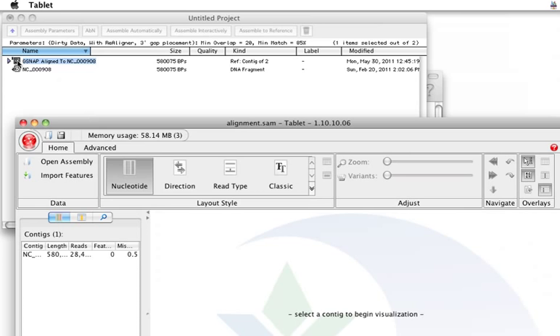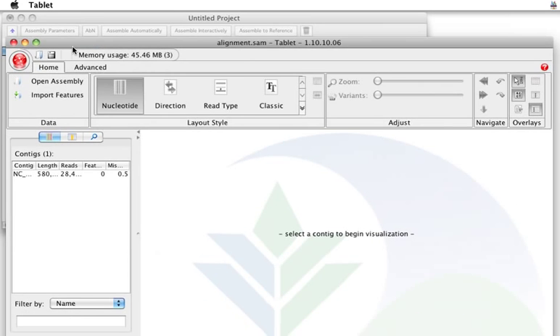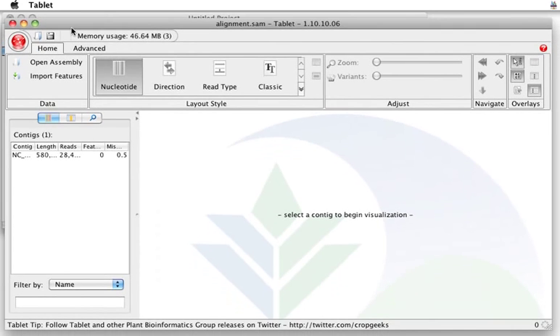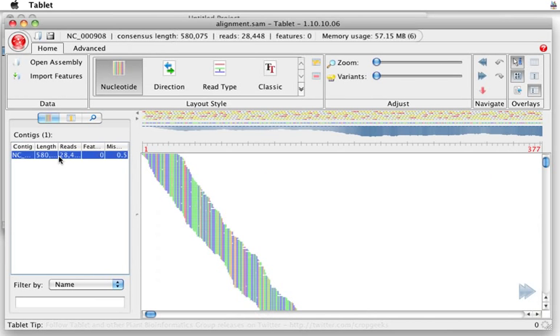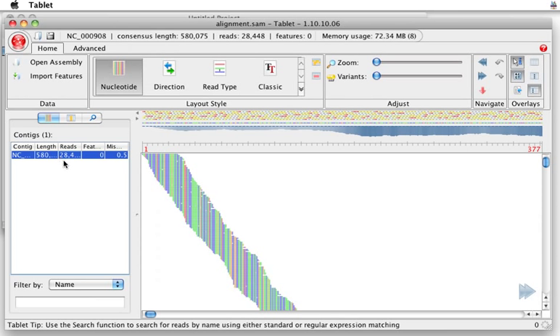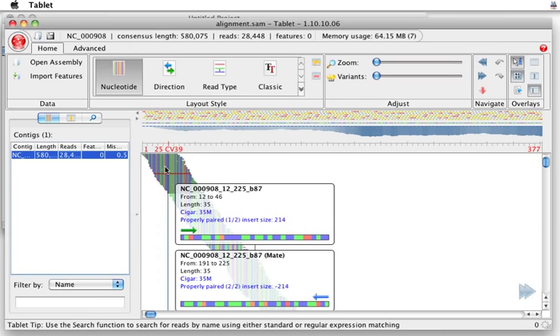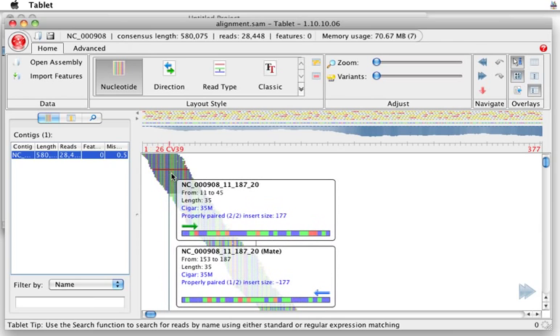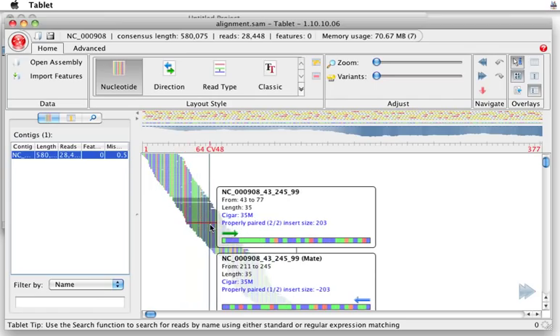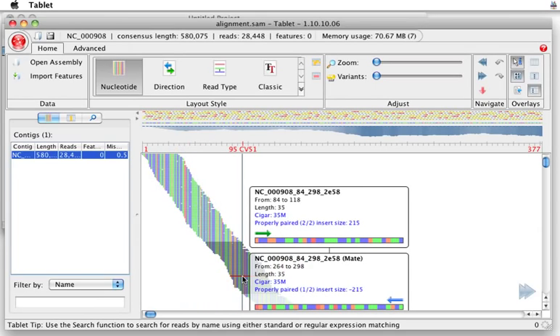You can do all the things that you're used to with Sequencher, building variants tables, doing restriction maps, all the normal analysis right in the Sequencher window. But you also have these new tools that we're going to continue to add to. So this all went into one big contig. And this looks like something you're familiar with.